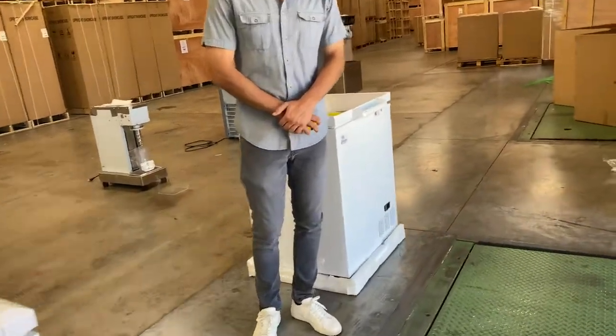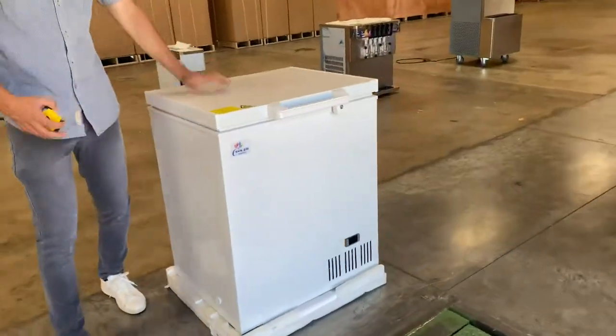Hello everybody, today we're going to go ahead and demonstrate to you some of our brand new items. We're looking at our ultra low temperature freezers.